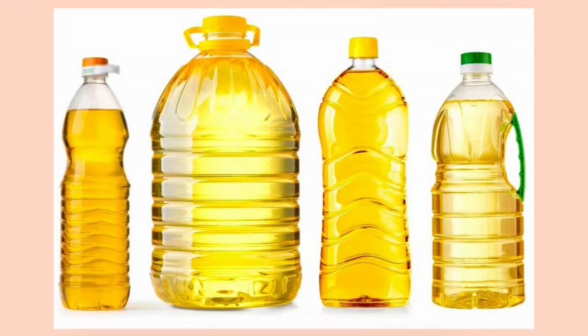Used cooking oil is commonly produced from domestic and industrial food preparation. Repeated heating and reuse cause physical and chemical degradation of the oil and lead to the accumulation of inorganic contaminants, particularly sodium and potassium, natrium and kalium respectively, in Malay, which originate from cooking salt, food ingredients, and the frying process.